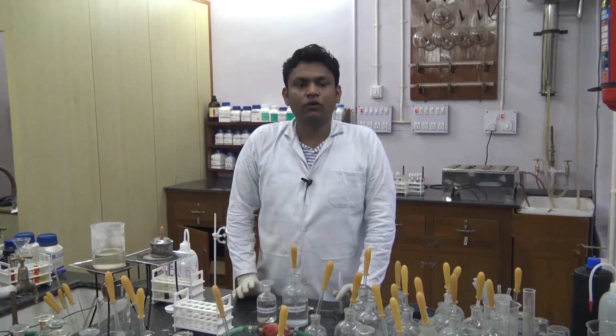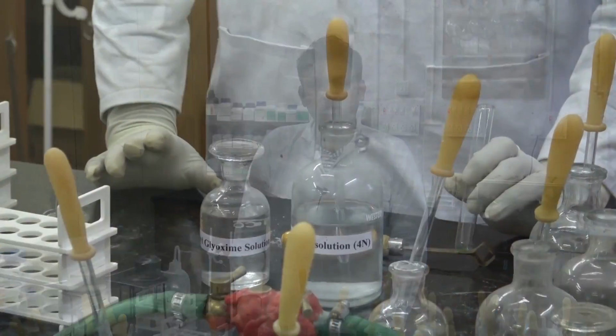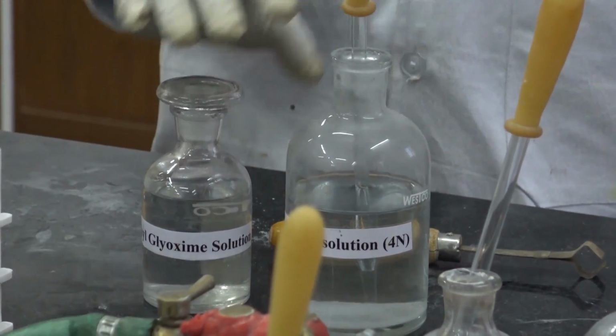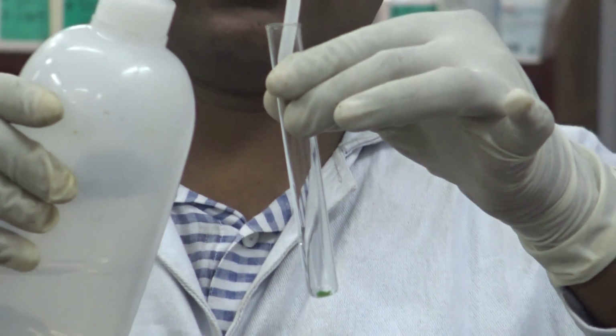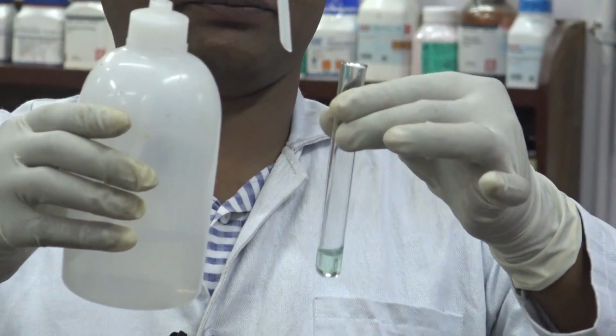Now we will go for the test of nickel, that is dimethyl glyoxime test. For this test we require sample solution, dimethyl glyoxime and ammonium hydroxide solution. To proceed for the reaction, at first take the sample and add distilled water to dissolve it.